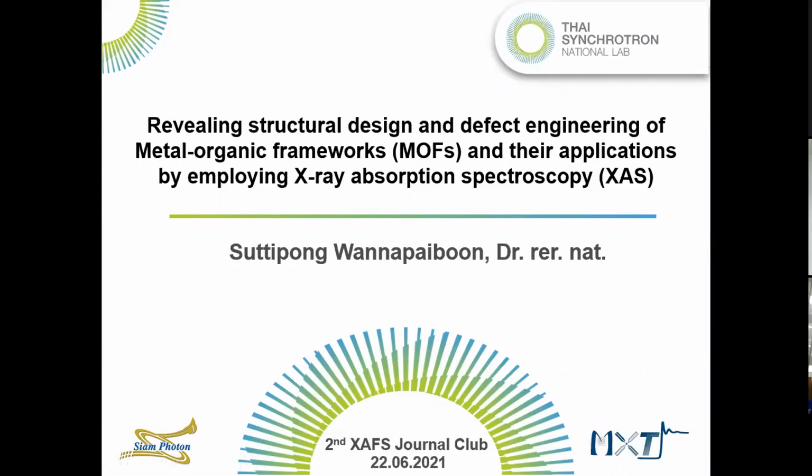So as Dr. Bantana has already introduced the talk of today, I would rather like to focus on the way that we use the technique called X-ray absorption spectroscopy, or XAS, which is quite famous at synchrotron facilities, and also a quite useful technique for giving specific information and details on structure and characterization of what we can get from the materials.